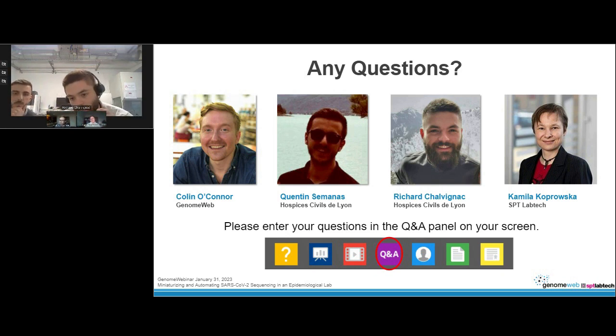Okay, so I must correct the question, because I guess the long read mention is because we are using the nanopore sequencing device, which allows long read sequencing. For the rapid branch that we use, it's not very much about long read, because the protocol that we use in nanopore uses fragmentation as in the COVID-seq, as described in the COVID-seq.